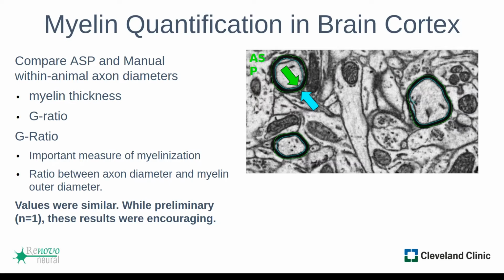This is an important study in animal models of demyelination and in human disease, and preclinical studies for drugs or compounds that promote remyelination often look at G ratio, which we could measure in conjunction with internodal length, which I showed before. It was cool to have the G ratio and the specific internodes they came from data together.